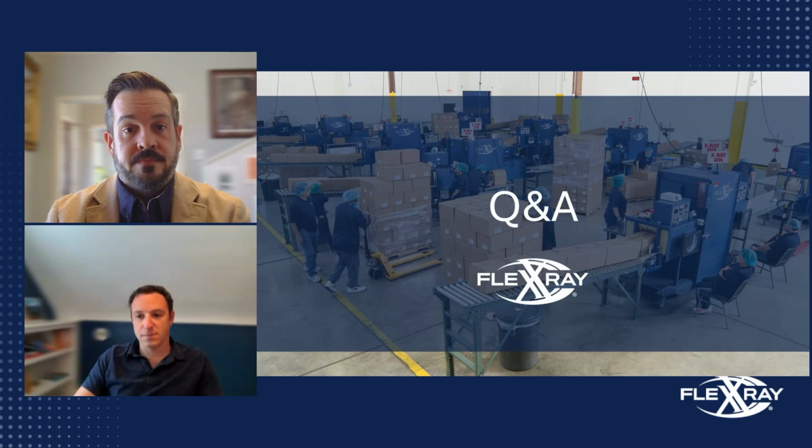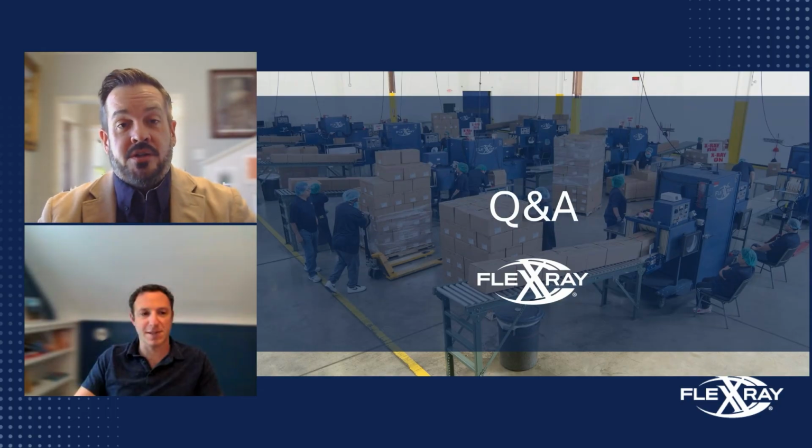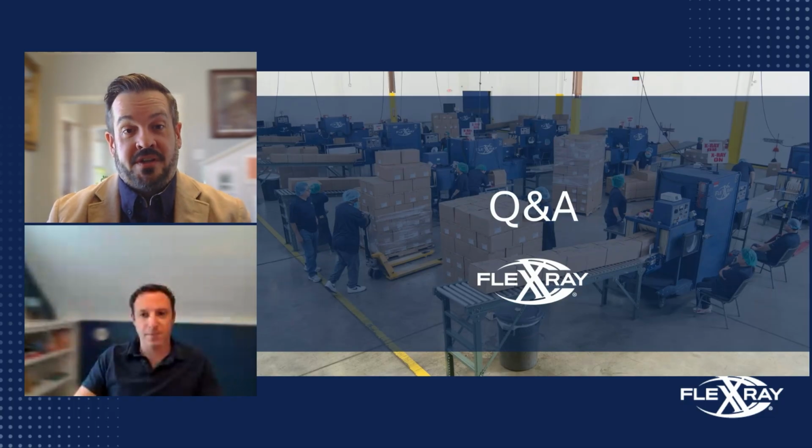Okay, let's throw a couple more at you. So I think this relates to qualitative inspection. Someone is asking about natural crystallization in products, whether CT can see that as we look through a case of product. It depends upon the crystallization issue. If crystallization is a potentially naturally occurring issue and is present in the product, it can make detection difficult. There are certain types of crystalline structures that are going to look very dense and appear as a foreign object.